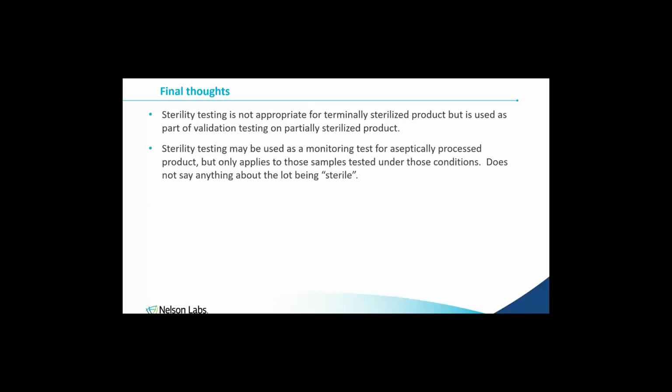All right. And with that, let's look at our final thoughts. So kind of to review what we've talked about. First one, sterility testing is not appropriate for terminally sterilized product, but it can be. It's part of your validation testing, but all those are done on partially sterilized, not terminally, not full sterilization, but partially sterilized. Yes, your fractional loads, your half cycles, your verification dosing.